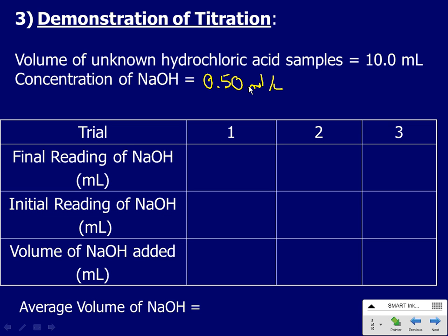That's good enough. And so at this point, what you need to do is open the tap, let a little bit run through, all right? Close the tap. The other thing you need to do with your waste container, with the mouth of the burette over the waste container, is rotate the burette and allow the liquid to flow out. So I'm coating the inside with the base. If there were some foreign chemicals in there, we're hoping that they're getting washed out with the base.